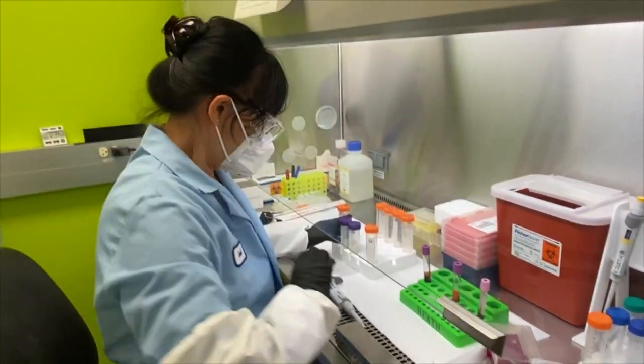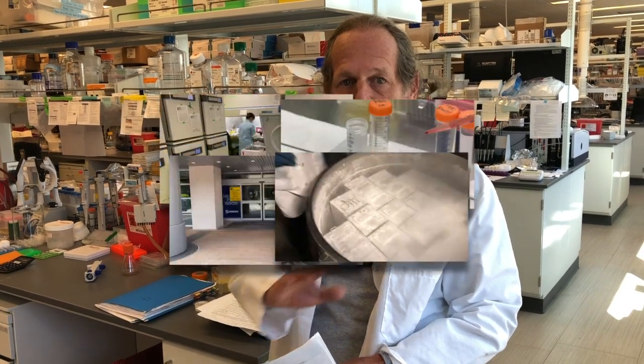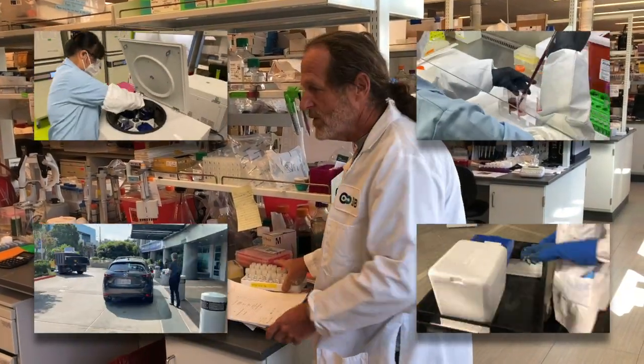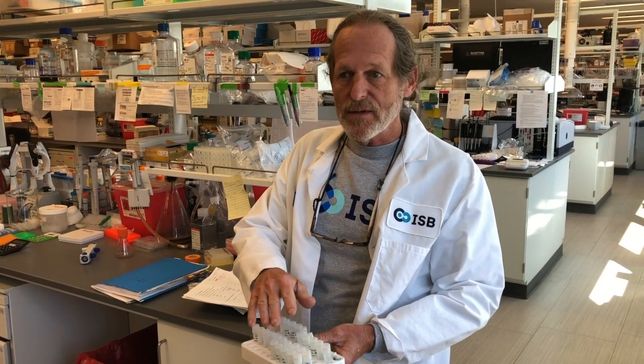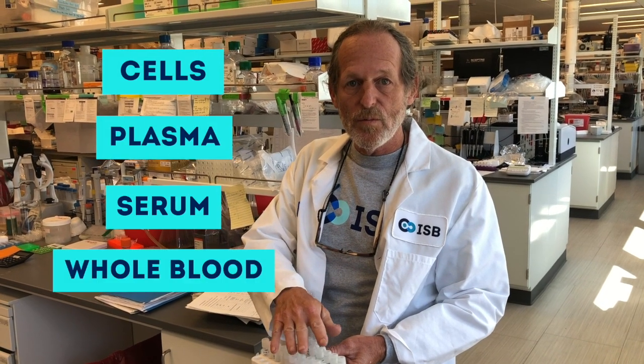that we do. When you sign up for a patient study, you'll check a little box that says yes. And once you check that box, lots and lots of things move into motion. And when you go and you give your blood, we're going to take that blood and we're going to end up putting it into lots and lots of little vials that contain all the components of the blood, from cells to plasma to serum to whole blood, etc.